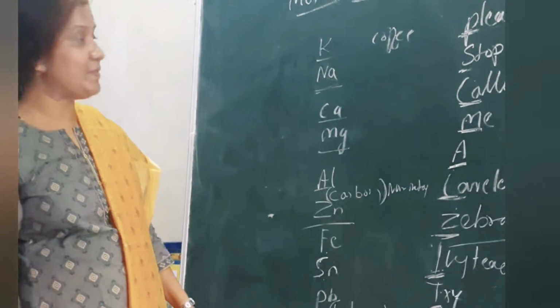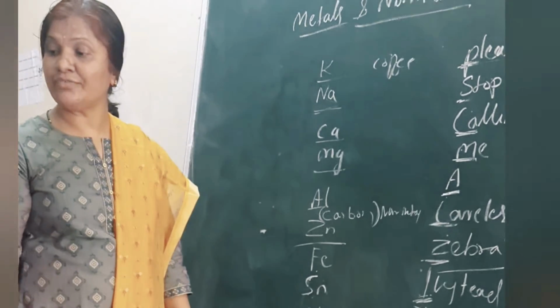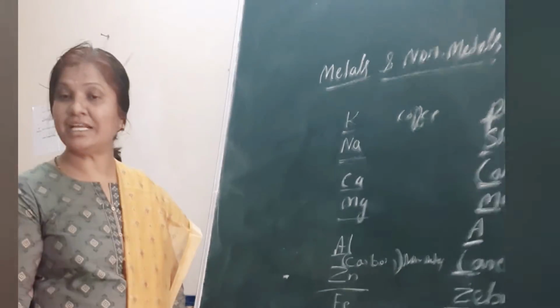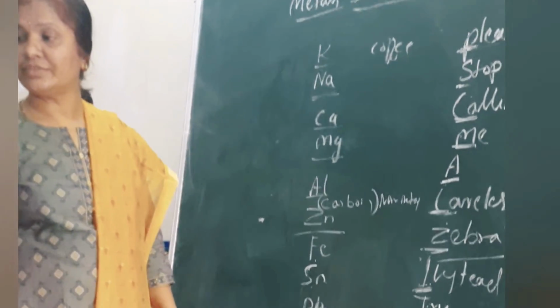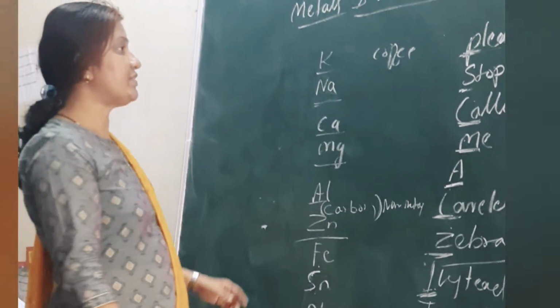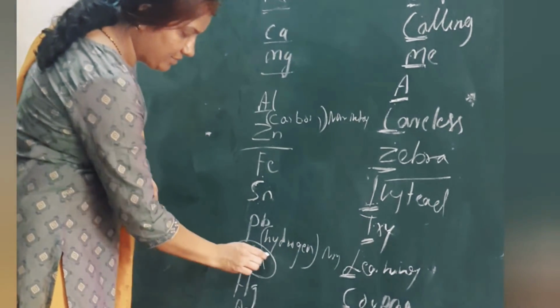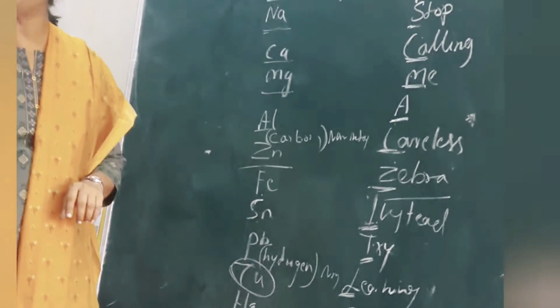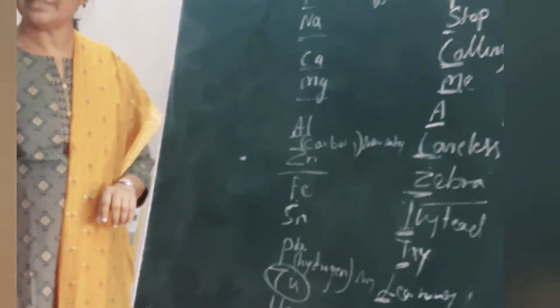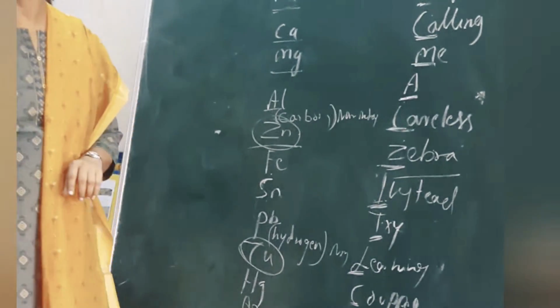Okay, in the first experiment, in the first beaker, which is the metal salt we took? First one, copper sulfate, right? Copper sulfate. Where is copper? Here. Okay? And what we inserted inside the copper sulfate? Zinc, right? Zinc, yes, ma'am.